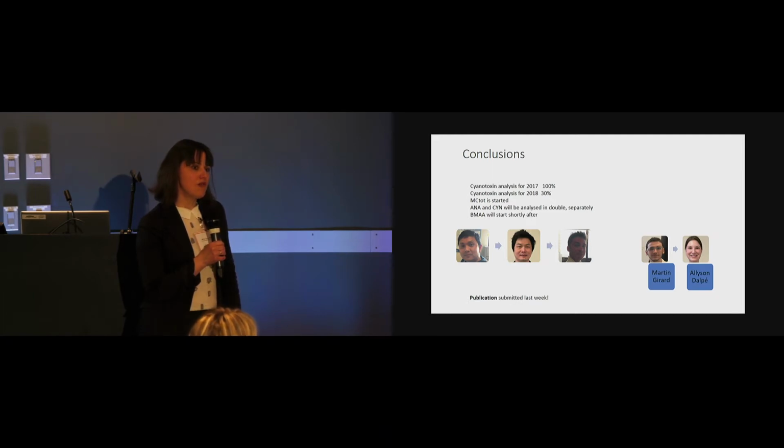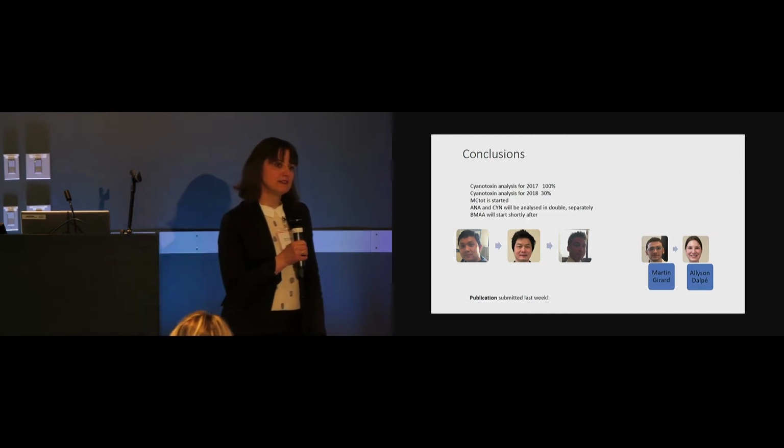Right. I'm curious, because if they're easy to do, it could be interesting to show as a comparison the increased sensitivity, or maybe this has already been established. Even just to show that they're not very sensitive, that maybe there are false positives, and so on.